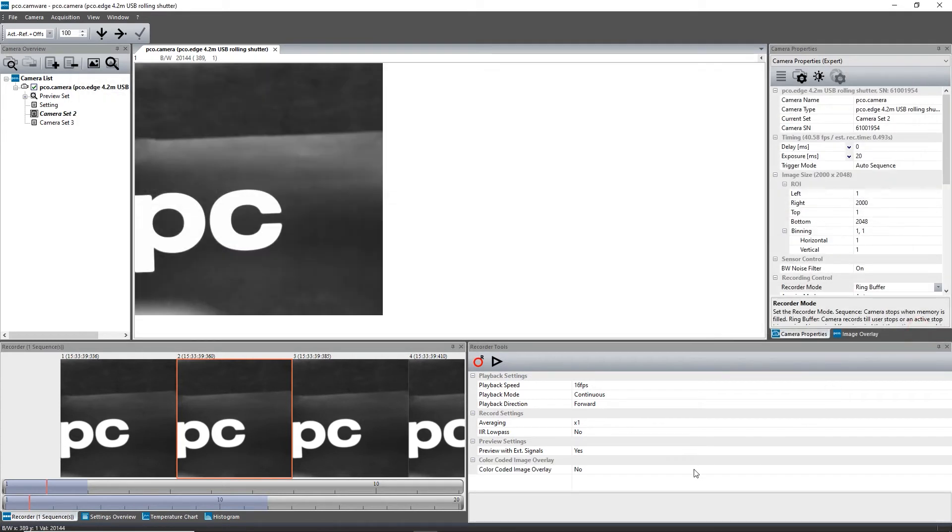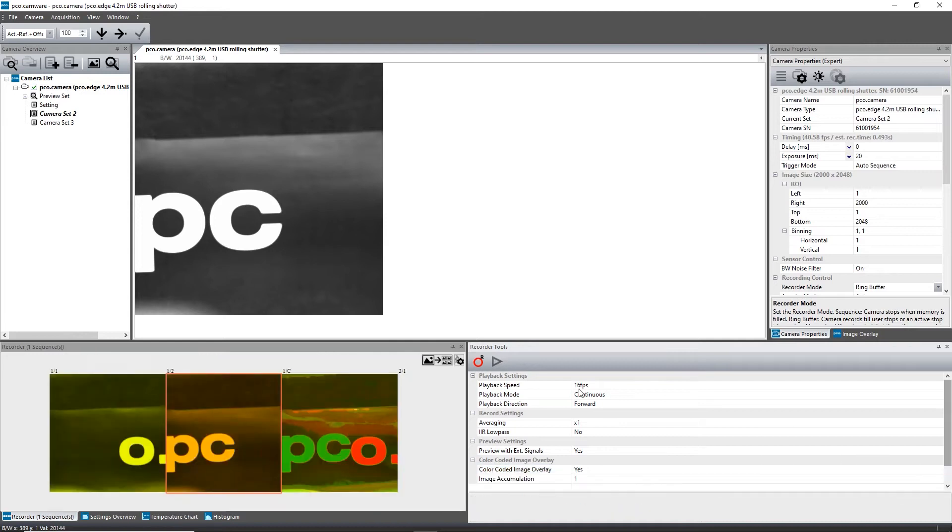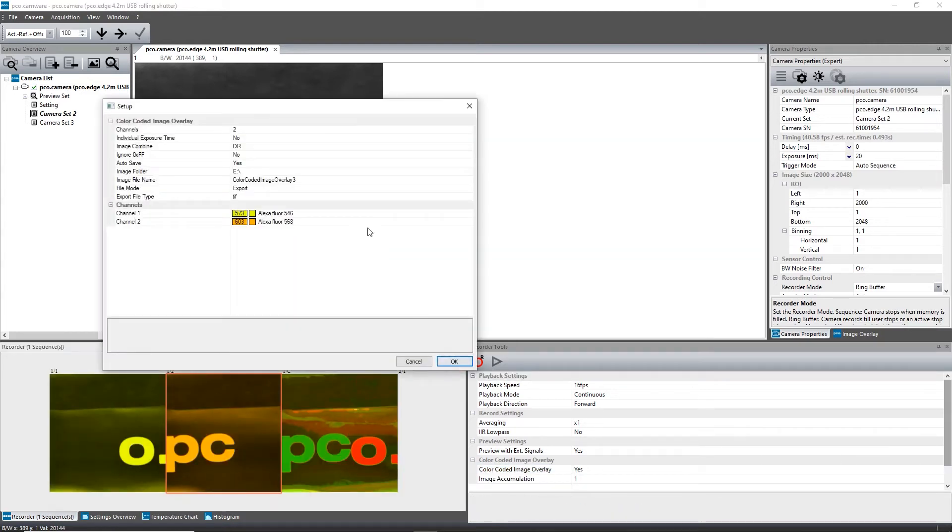When set to yes, two buttons appear: acquire and setup. With setup, the pseudo lookup table can be configured.